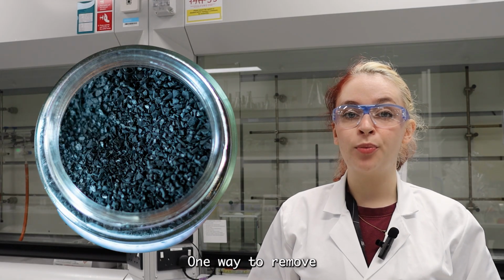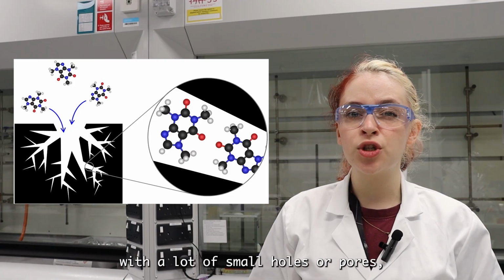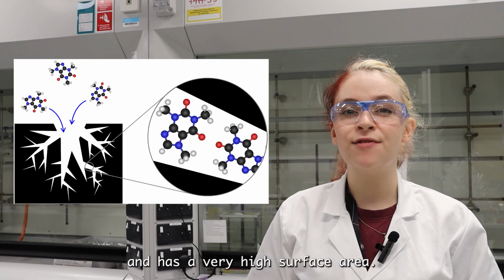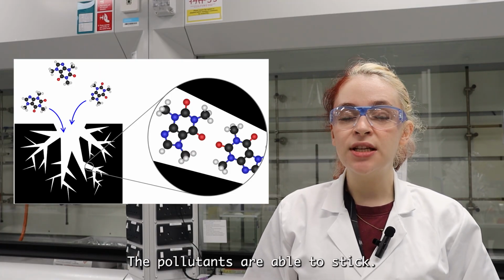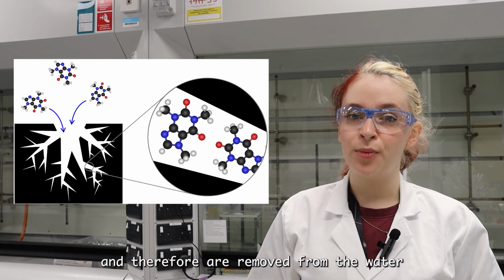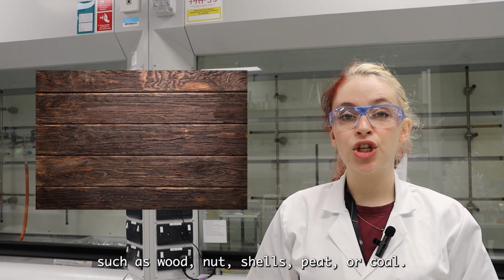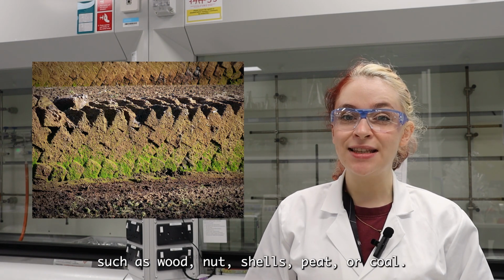One way to remove pollutants from water is using activated carbons. This is carbon with a lot of small holes or pores and has a very high surface area. The pollutants are able to stick, also called adsorb, and therefore are removed from the water. Activated carbon is usually made from biological materials such as wood, nutshells, peat, or coal.